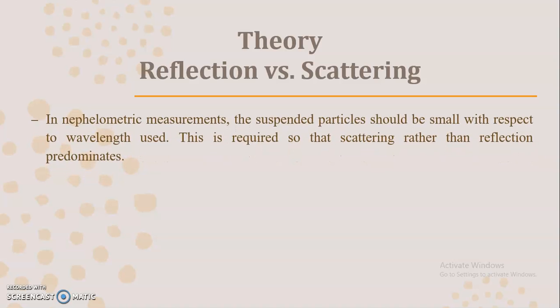In nephelometric measurements, the suspended particles should be small with respect to the wavelength that is used, and this is required so that scattering rather than reflection predominates.